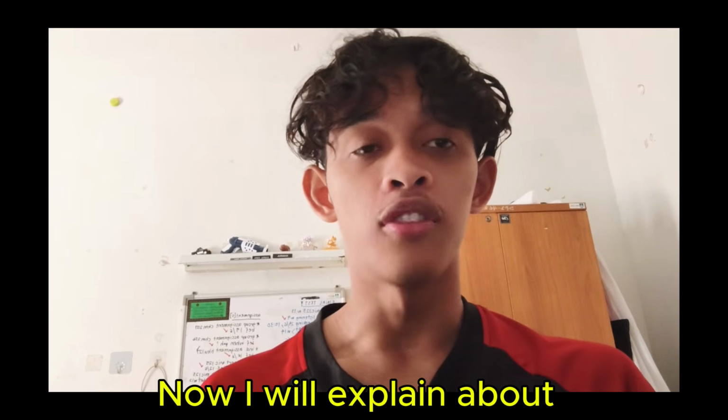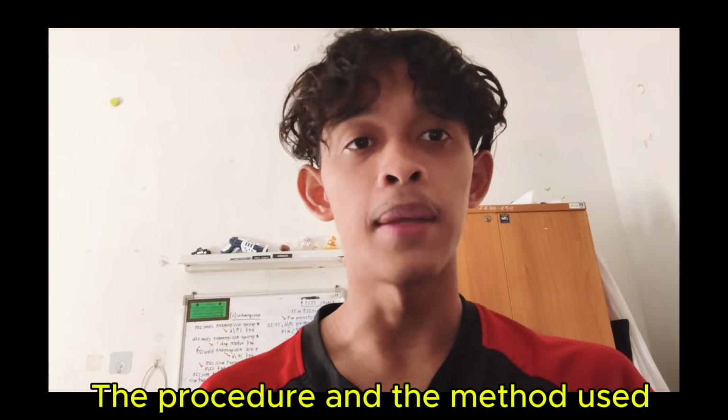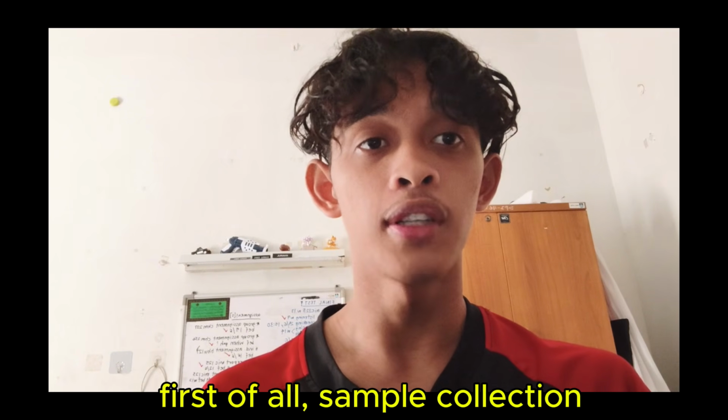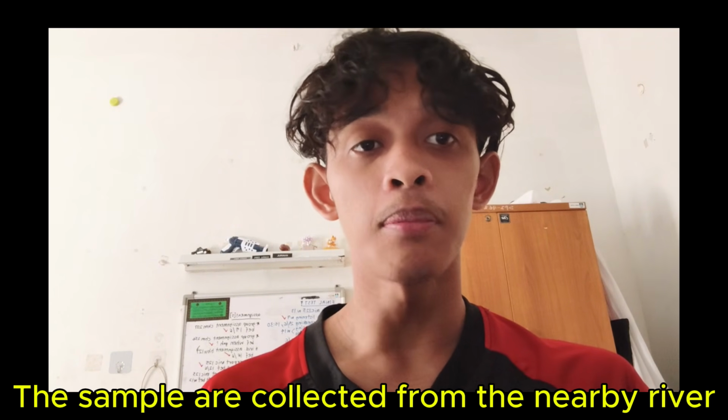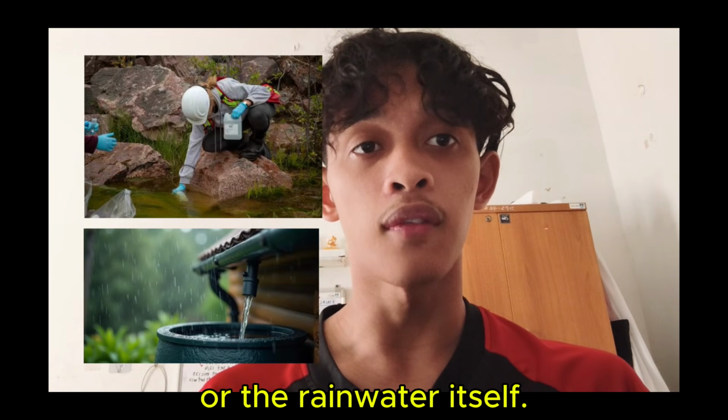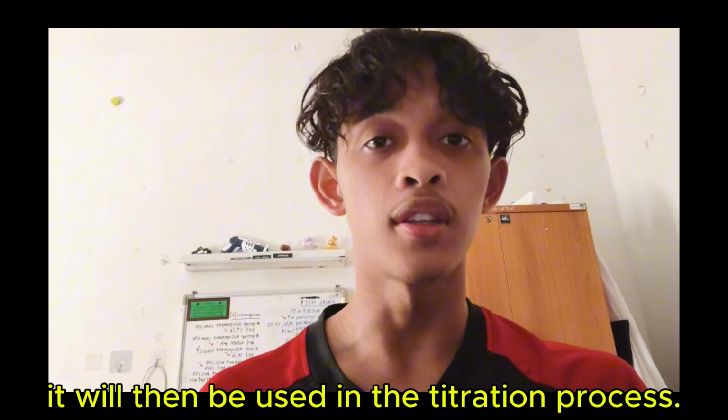So now I will explain about the procedure and the method used in the titration process. First of all, sample collection. The samples are collected from the nearby river or the rainwater itself. It will then be used in the titration process.